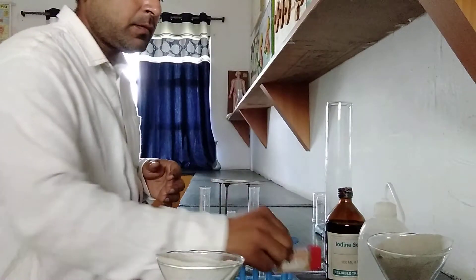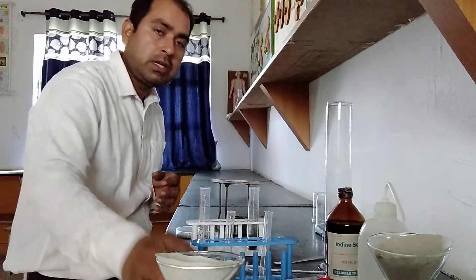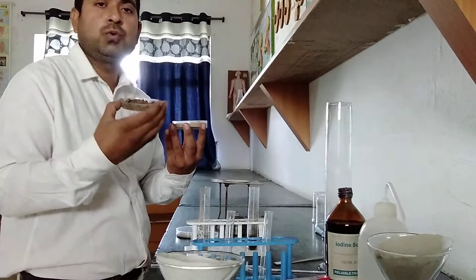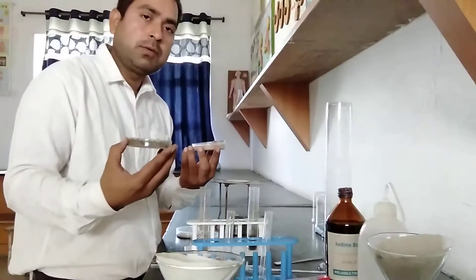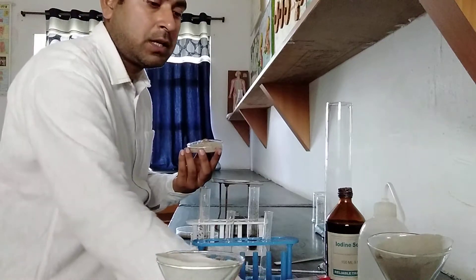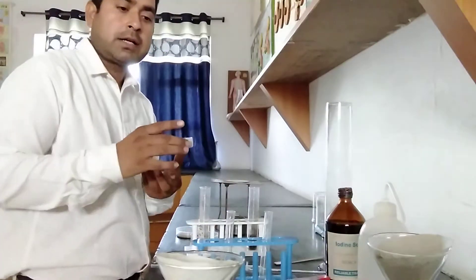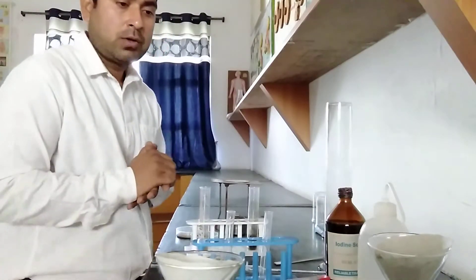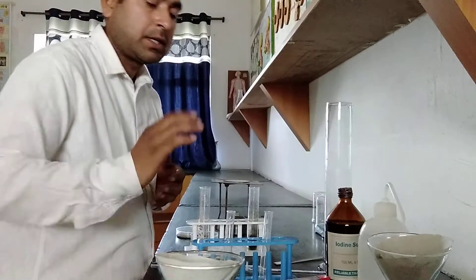Students, why are we using this? We are using it for checking the water holding capacity in two different types of soil. So two different types of soils are here — garden soil I have collected, and another one is sand. Sand is not basically used for agriculture. This is the first setup.